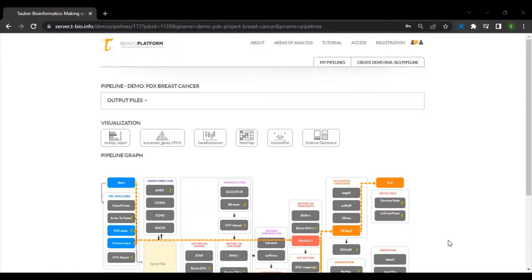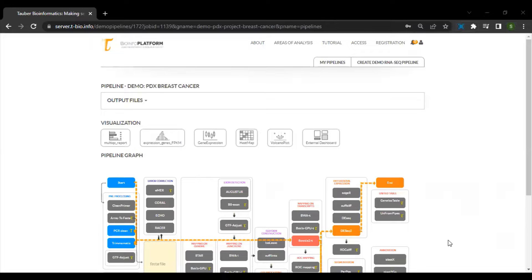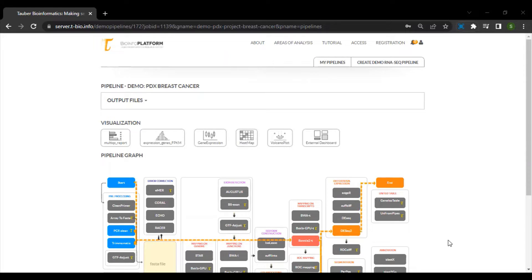Now that you have finished running the RNA-seq pipeline along with the differential gene expression option, we can take a look at the various outputs that we get.